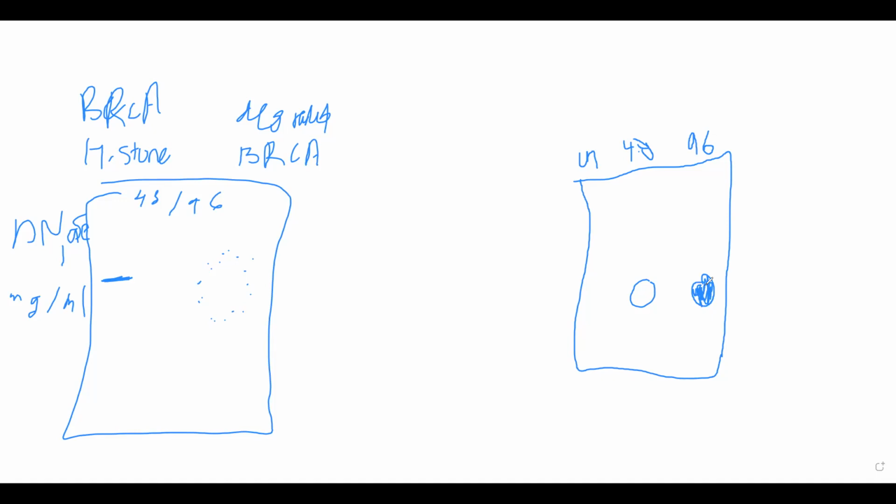Just a final word: transcription is not strongly present or increased at the 48-hour mark. That's why it is shown in a less dark color.